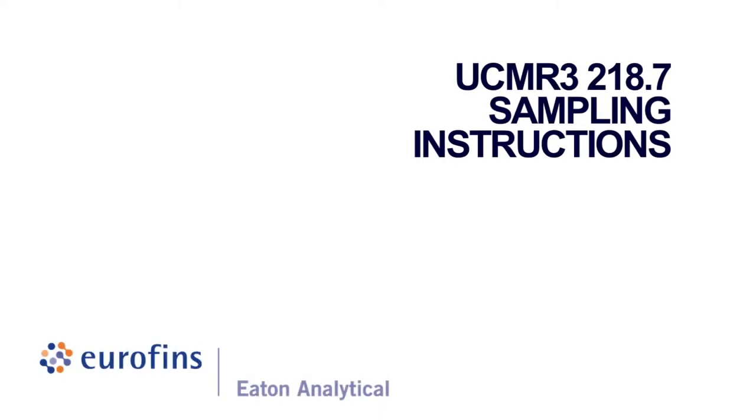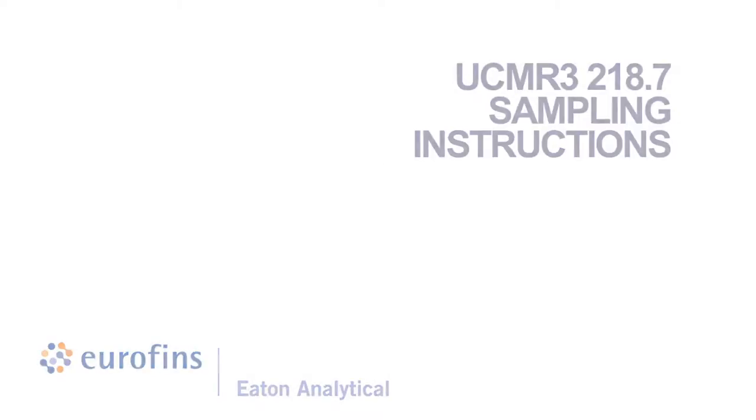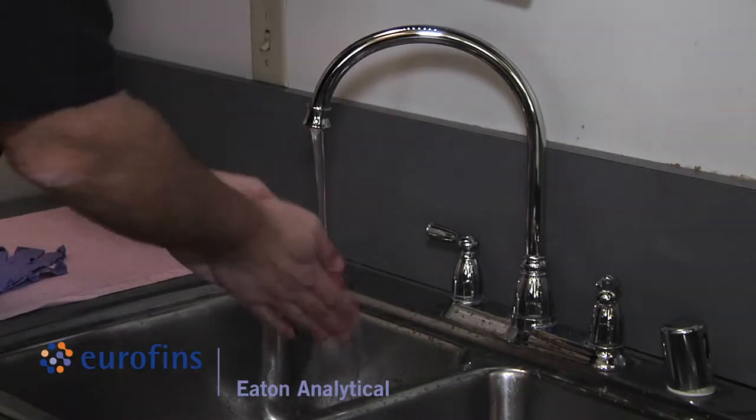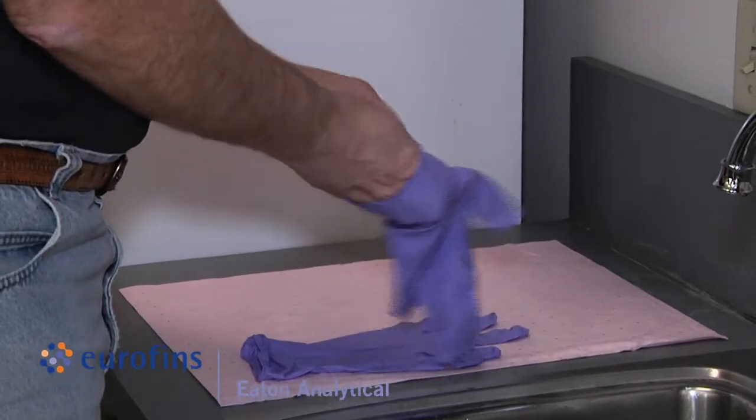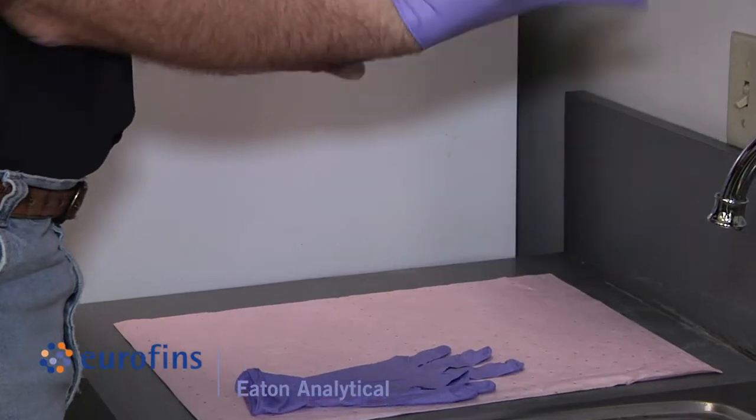UCMR 3 218.7 sampling instructions. Wash your hands before sampling and wear the powderless nitrile gloves which are included in the kit during sampling and sample handling.